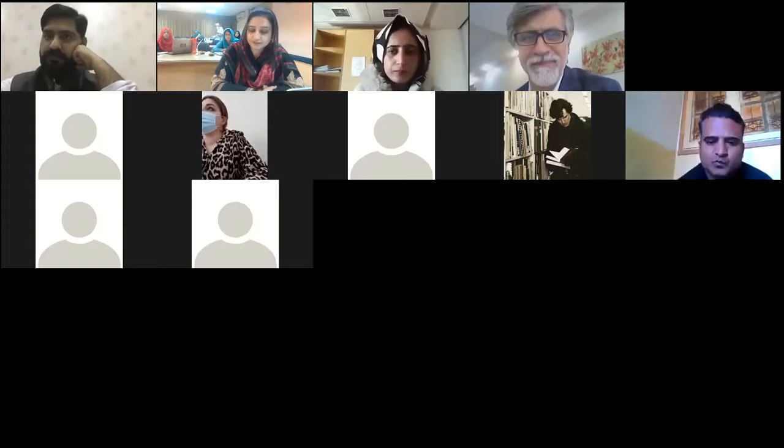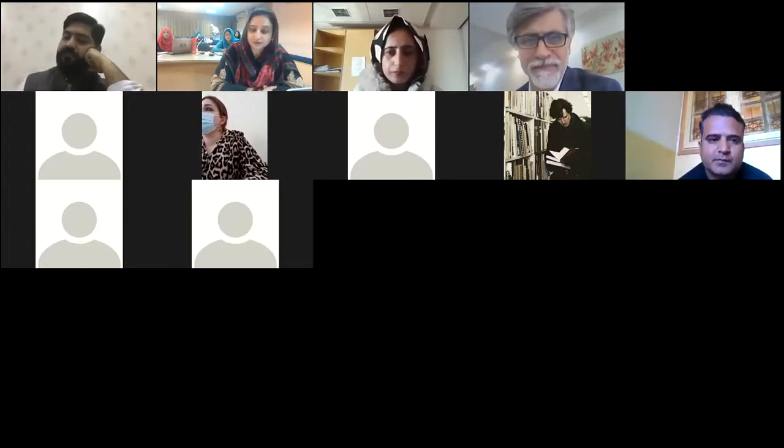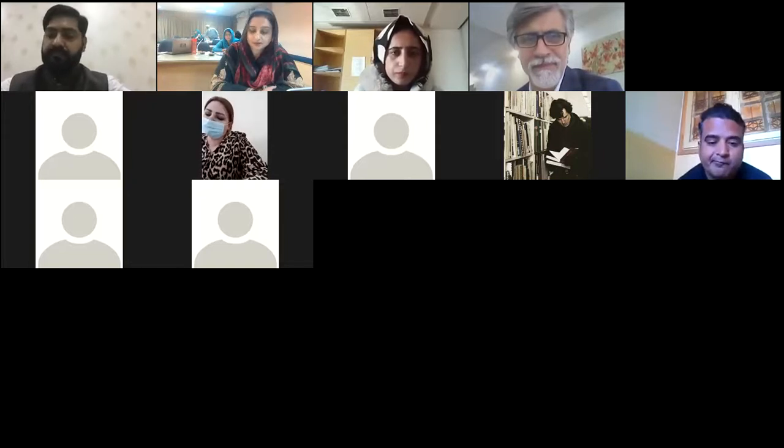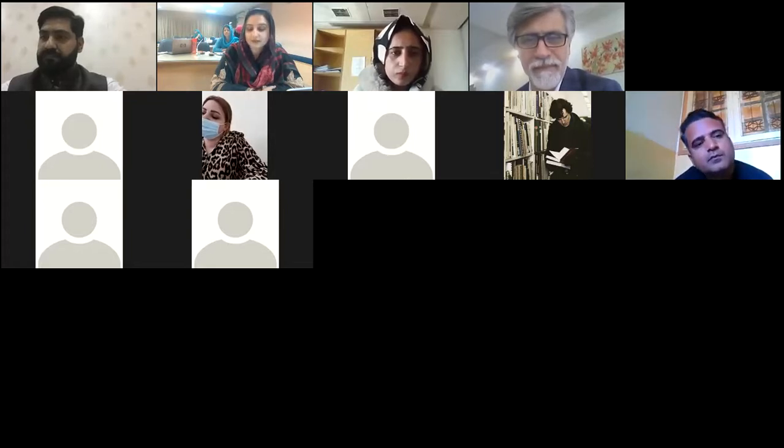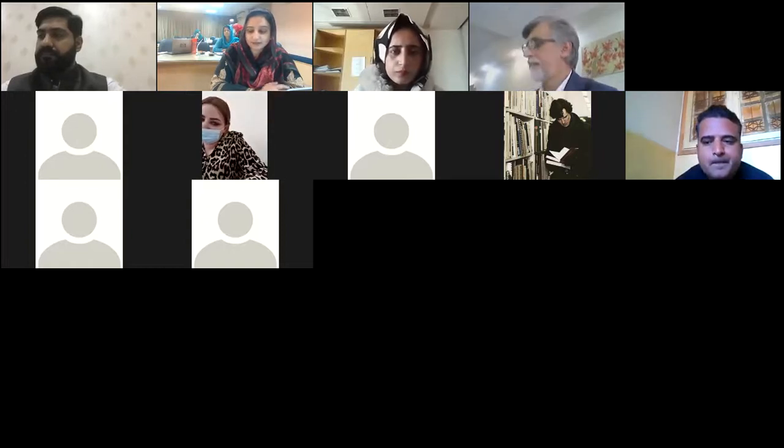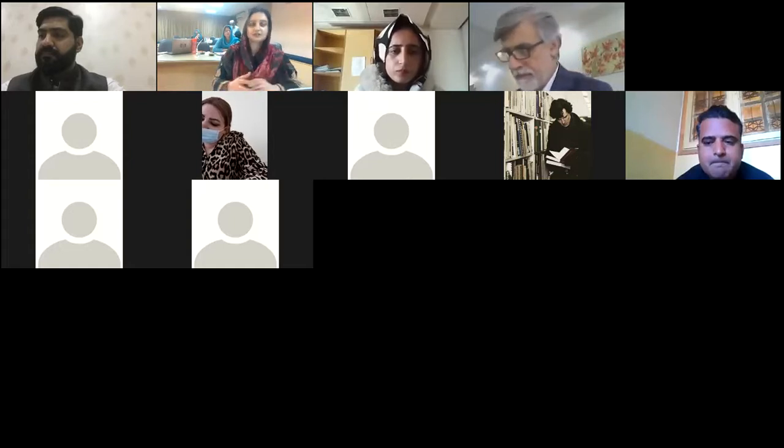Participants, let's move to the second part of today's workshop that is actually based on the hands-on training. And as we all are on a virtual conference, we are presenting the whole procedure of plant tissue culture as a basic one, of course, covering each and every part, including the preparation of the instruments, then media preparation, cleaning, sterilization, initiation, selection of your plant, till last shooting, rooting, and till the field.